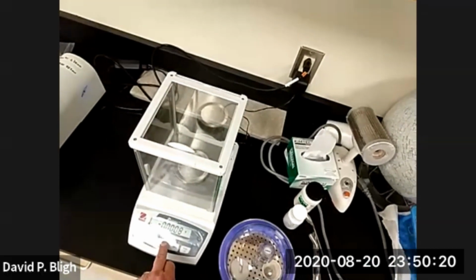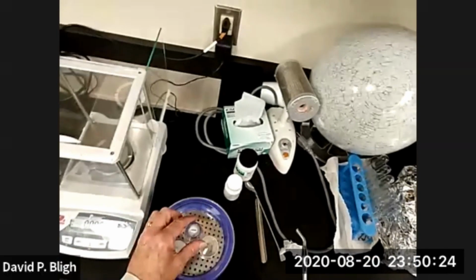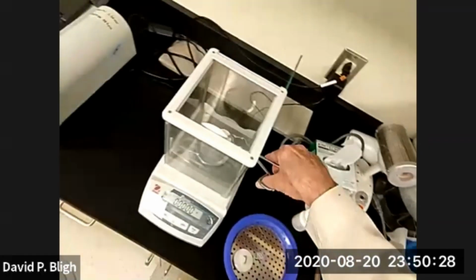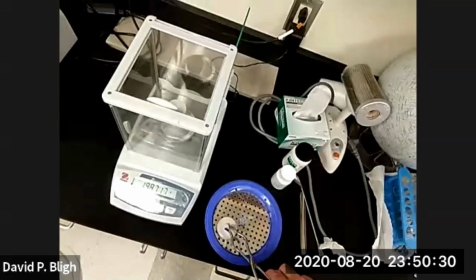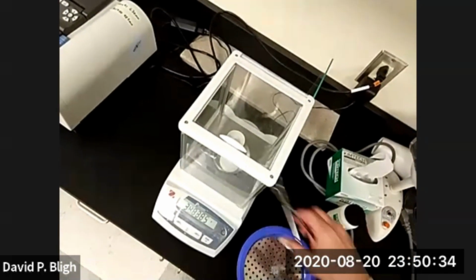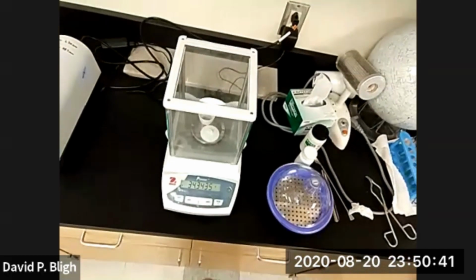Okay, let's reset this to 0. Okay, now let's find the tare weight for this crucible. There. And its lid. There we go. 34, 34, 35.